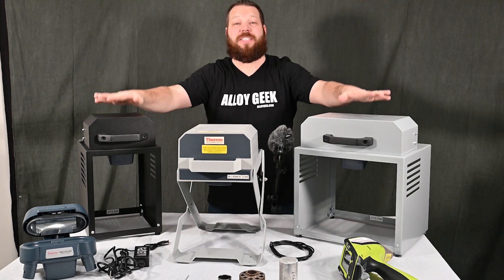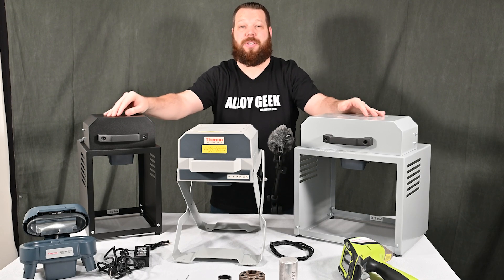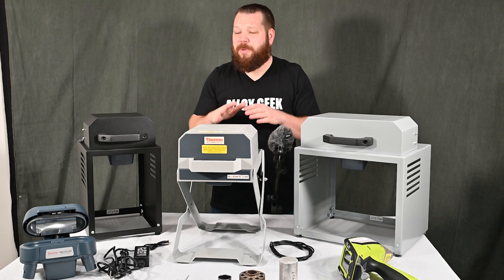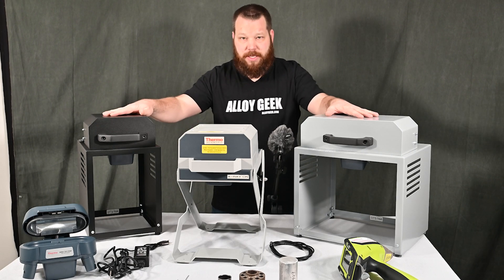Hi guys and welcome back to AlloyGeek. In this video we're going to talk about the test stands for the Niton XL2 and Niton XL3T. While we're talking about these specific test stands, the same principles we'll discuss today are going to apply to all the handheld XRFs in the industry and their test stands.